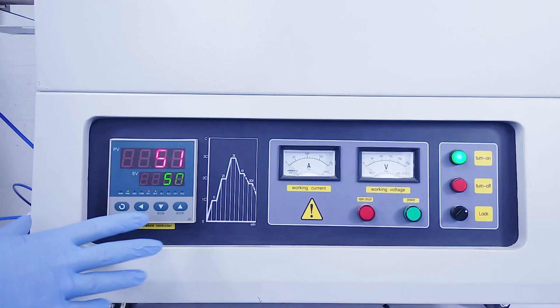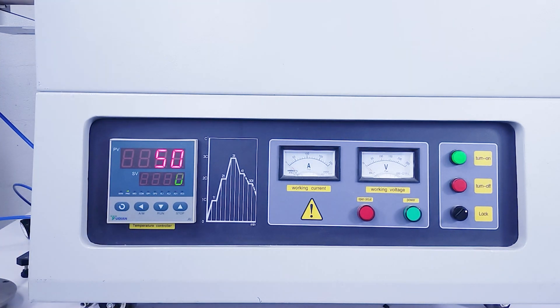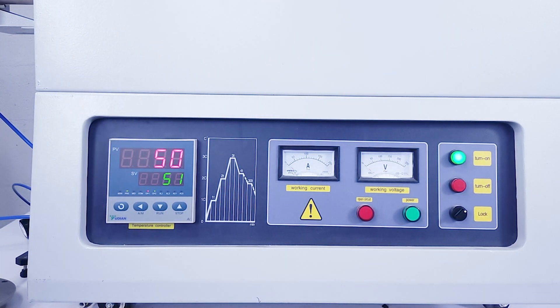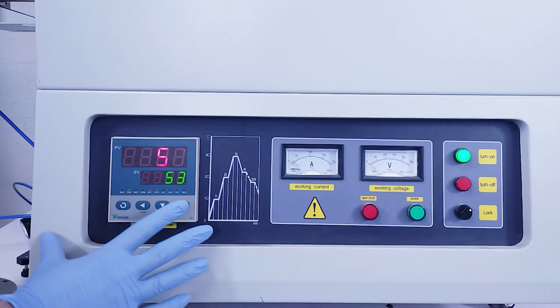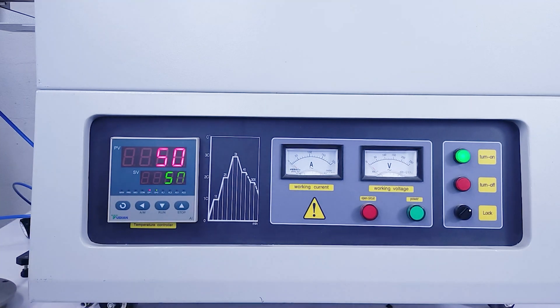To launch the run, press the green button and hold the down arrow until 'run' is displayed on the screen. If the run number doesn't match the green one, it means that the run wasn't launched properly and the furnace isn't heating up. To stop the run, hold the up arrow until 'stop' is displayed on the screen.